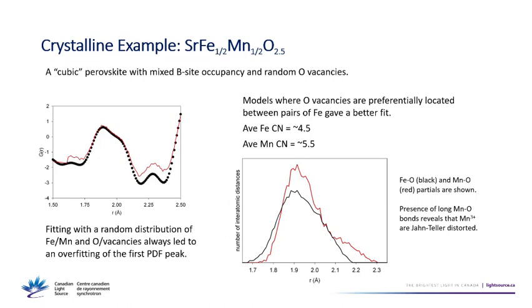Yeah, I never thought about that, but I think that should work. Like you could simulate what you would get from an electron PDF. Because in some metals, for example, some precipitates form with long-range order or short-range order. So if we capture diffraction patterns of those short-range order precipitates in TEM and do the same calculation on them, then we can extract the average from the patterns. But we need to change the scattering factor of X-ray to electron. Yeah.